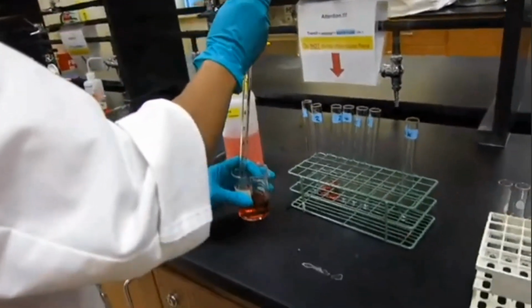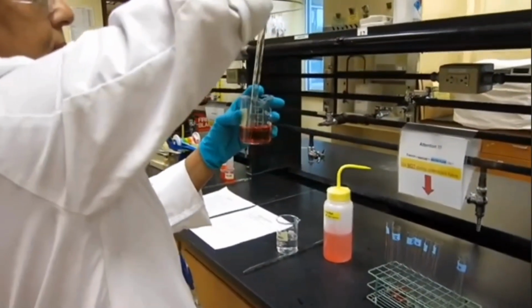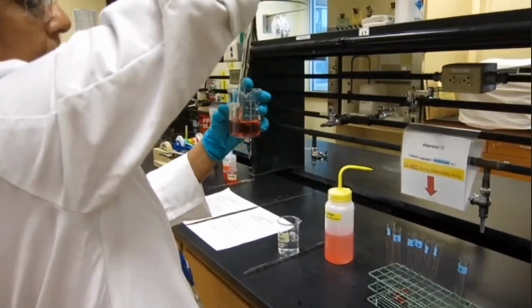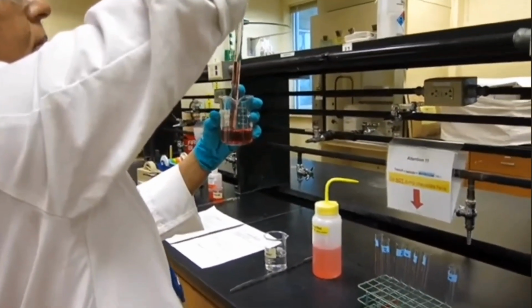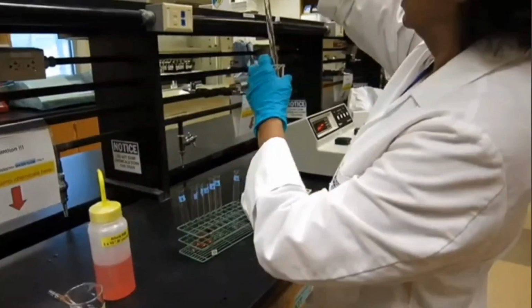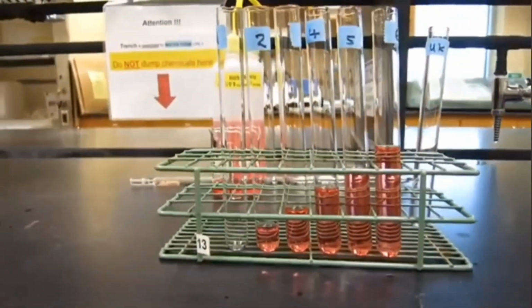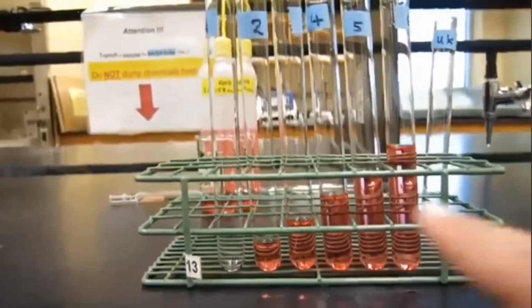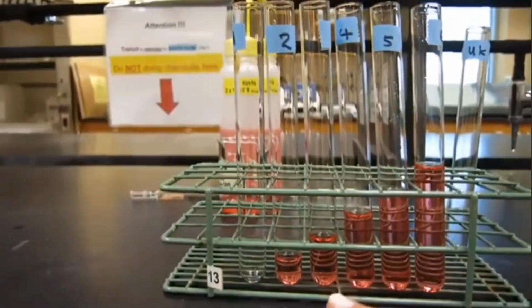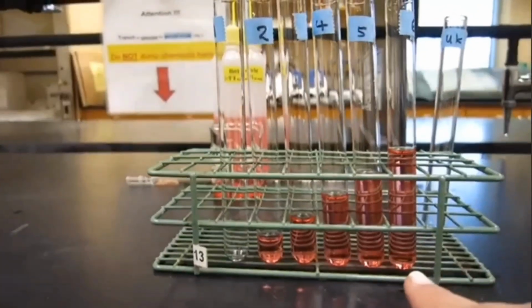Test tubes are being filled with Allura red stock solution. So you see that the first one we didn't add anything, 0, 2, 4, 6, 8, 10. So we can see that the volume is increasing.